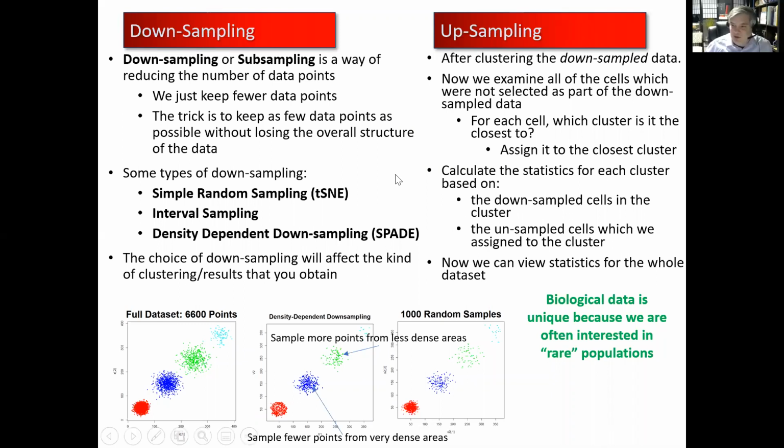It's really straightforward. So say we grabbed a million events and we downsampled that to 100,000. Well, what do we do with the other 900,000? Right? We've got all that data. Do we really just get rid of it? Well, the answer is no.